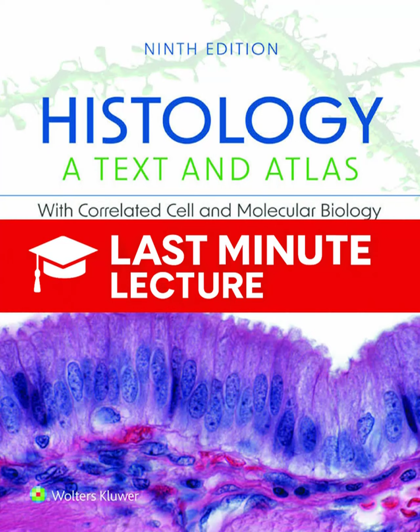Okay, beyond the standard bright field, there's a whole catalog of specialized optical systems designed to see things that are otherwise invisible. We can start with phase contrast microscopy. This is a technique for unstained samples. It exploits tiny differences in the refractive index, the density of different parts of the cell. It converts those invisible density differences into visible contrast. So it's perfect for looking at living cells. Exactly. It's extremely useful for observing unstained living cells in culture.